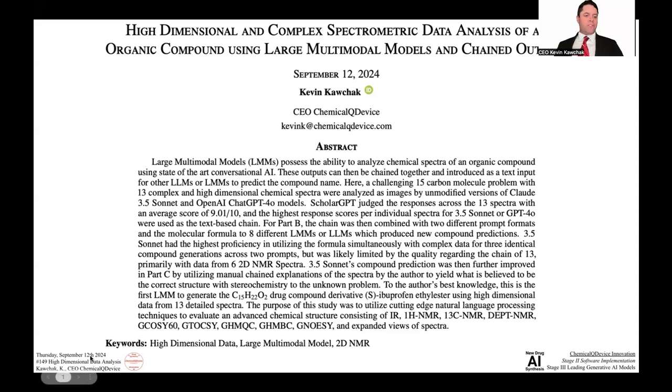This is Thursday, September 12th, 2024, for 149: high dimensional and complex spectrometric data and analysis of an organic compound using large multimodal models and chain outputs. So I wanted to do the study to really stretch the AI models to see how well they perform with just a ton of data.